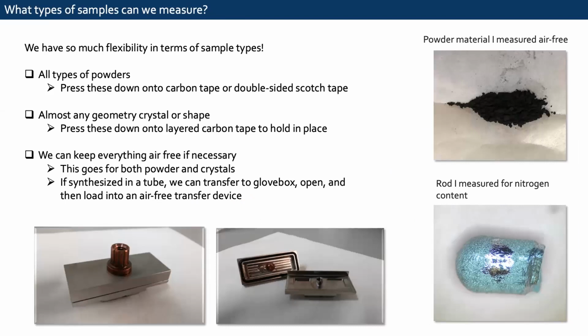And there's a lot of different types of samples you can measure. As I said, there's a ton of really cool stages that aren't commonly used. Usually I use some sort of standard stage where we're just putting a powder or crystal on, but there's so much flexibility. You can use any geometry of crystal or shape, any powder, and the only thing you have to make sure of is that the sample is very well adhered to the stage so it doesn't get sucked off into the vacuum.